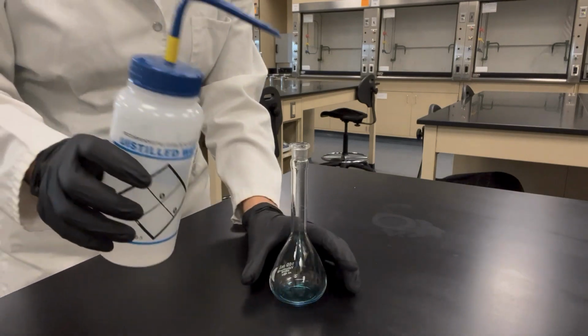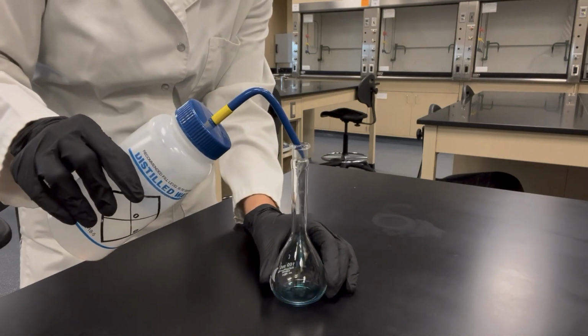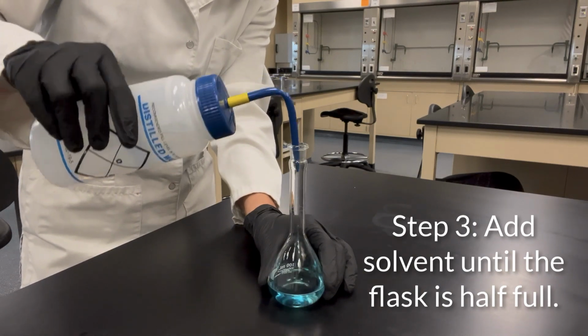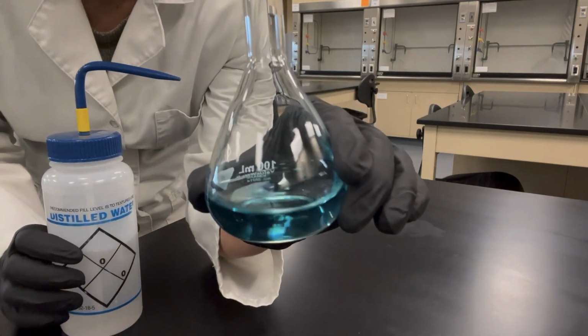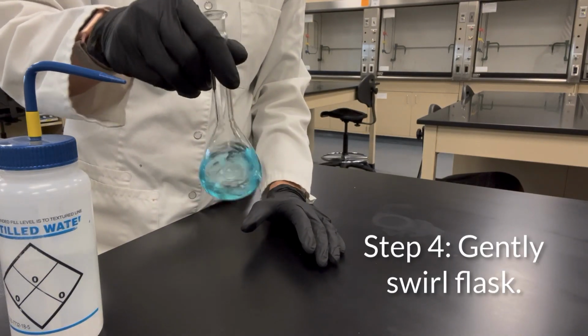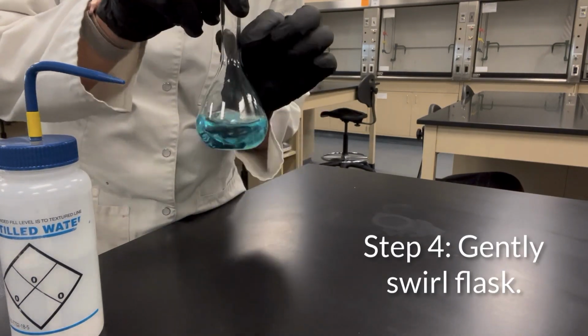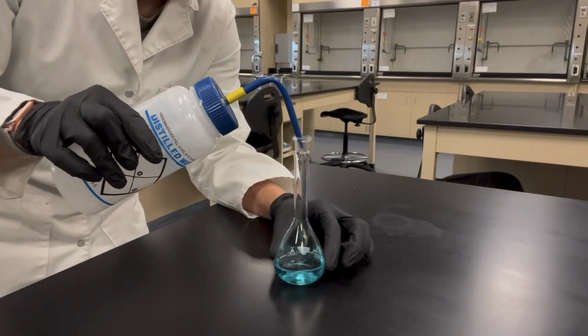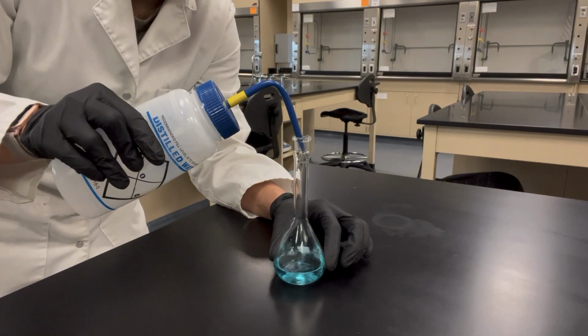Next, you'll take your solvent and fill your volumetric flask about half full. When it's half full, you want to give it a nice gentle swirl to make sure that all the liquids have mixed. After you've gently swirled it, you want to again fill your volumetric flask with your solvent.